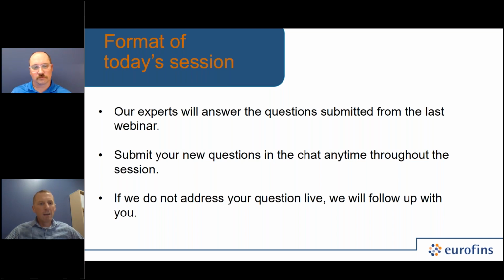Okay. All right. Well, let's talk a little bit more about plate counts versus flow cytometry. So, what do you see in terms of the differences you'd encounter on the same product for a CFU versus AFU? And then further, how would you see those differences change over the course of a shelf life of a specific product?